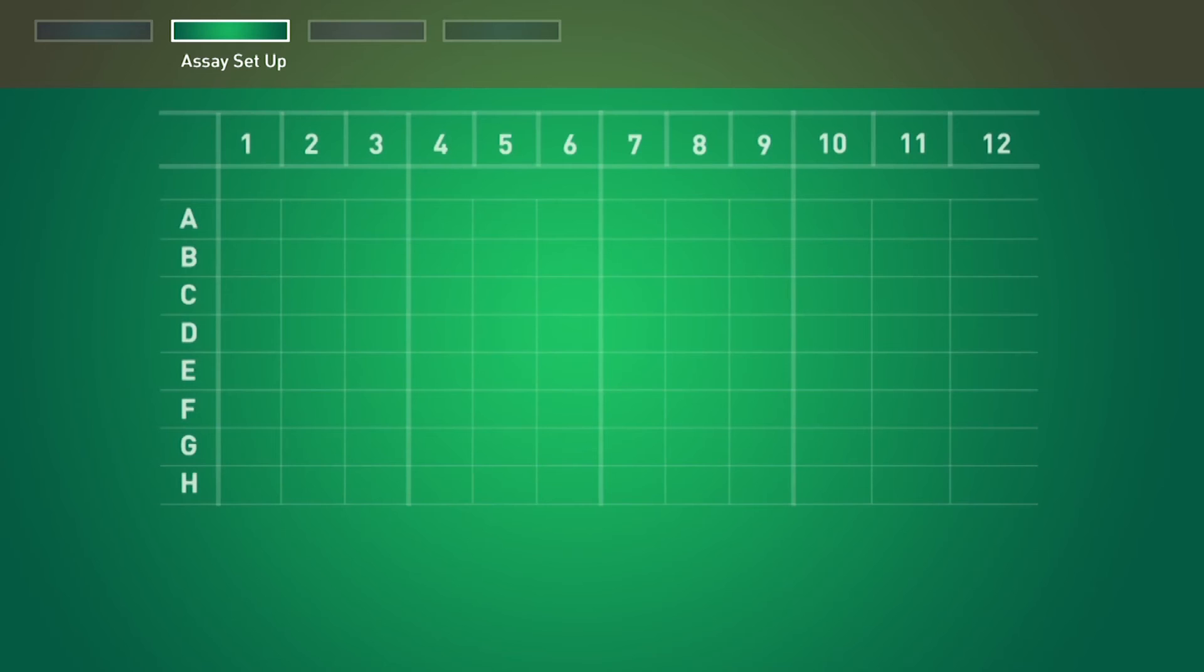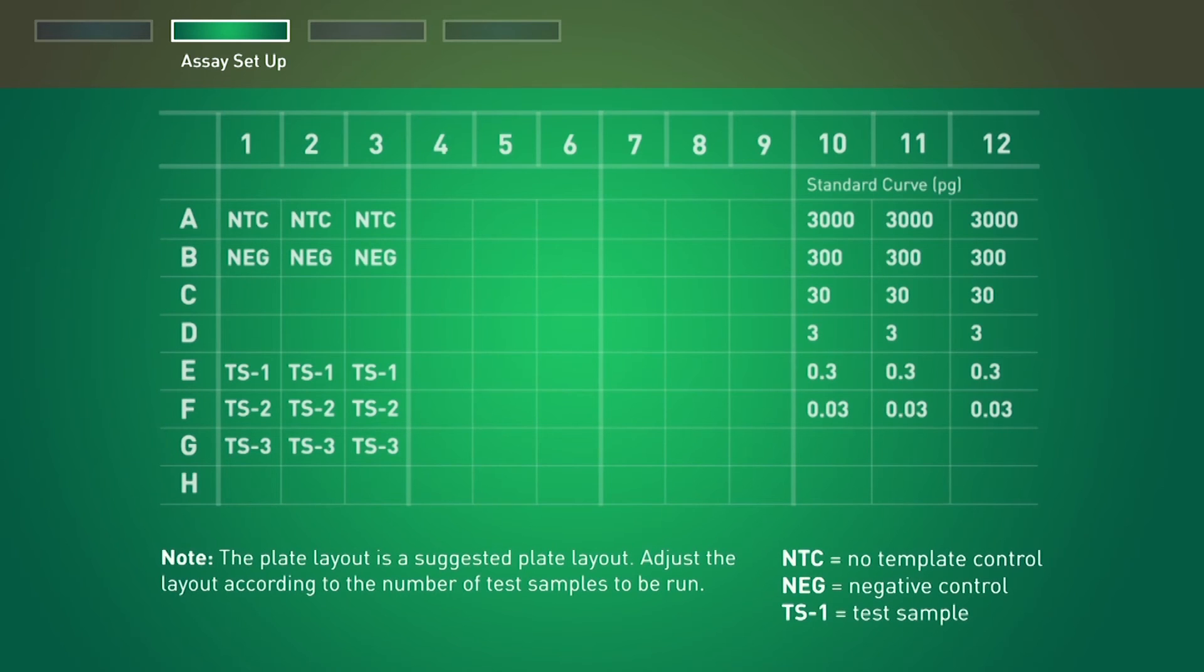First, set up a 96-well PCR reaction plate using this example plate layout. Adjust this layout according to the number of test samples to be run.